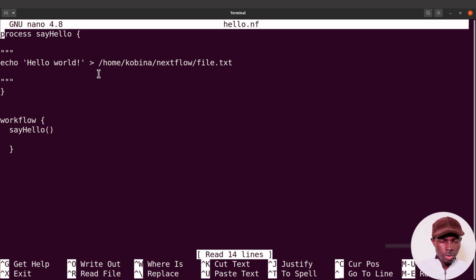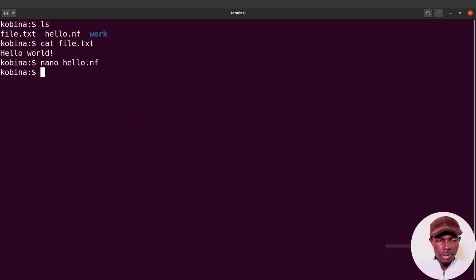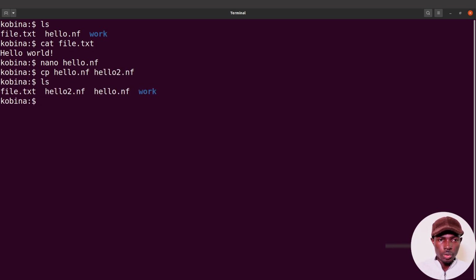I think what I'll do is make a copy of the script and edit it, so that we don't end up messing the original file, the first script. So I'll use cp, and I'll say hello2.nf, and then I'll use that one. I want you to also make a copy and use that one. So we are now going to edit this one here, the hello2.nf.